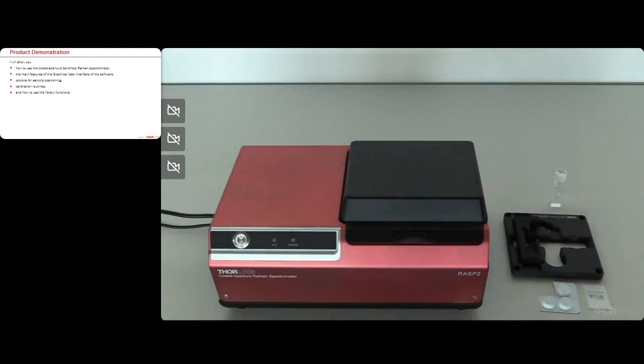I will now show you how to perform measurements with the newly released Benchtop Coded Aperture Raman system. Even though the system is designed to be a benchtop device, it is still portable. RASP 1 contains a 785 nanometer laser, whereas RASP 2 does come with a 785 nanometer and a 680 nanometer laser. These lasers are class 4 lasers, but the system as a whole does come with an interlock feature in the lid, making the entire system a laser class 1 system.